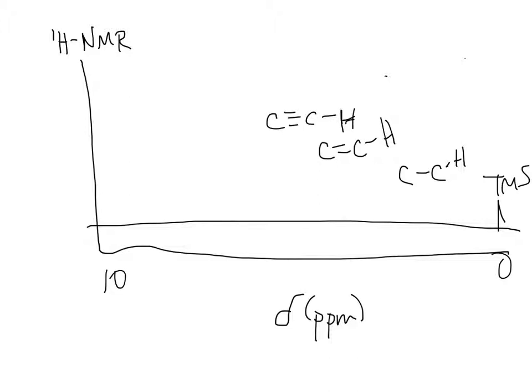What if, here I'm just going to use this color, what if we have a hydrogen that's on an aldehyde, which once again, don't forget your functional group. So let's say that we have a hydrogen on an aldehyde, and now we're just going to talk in broad generalities. A hydrogen that's on a carboxylic acid.